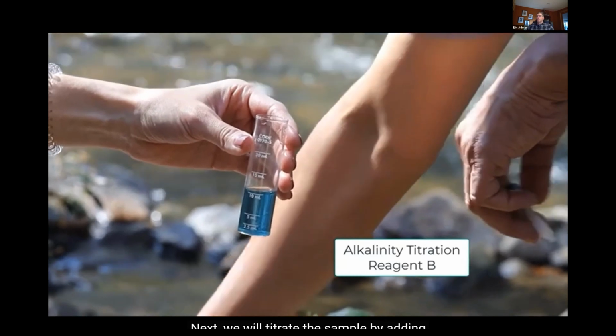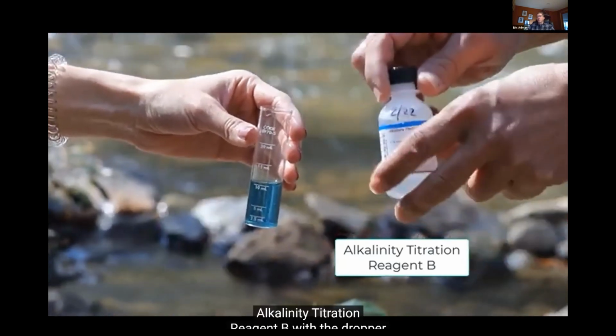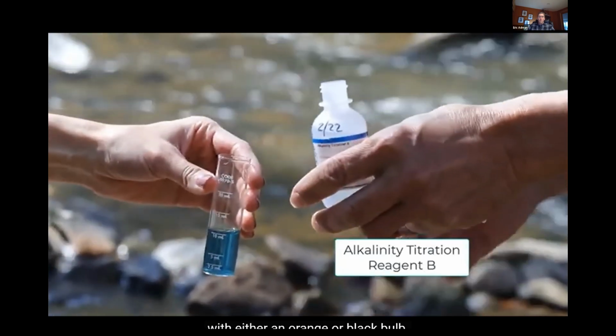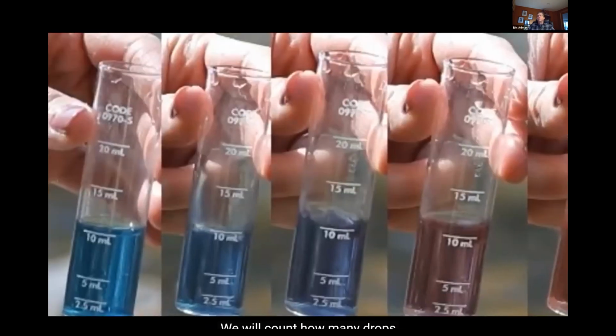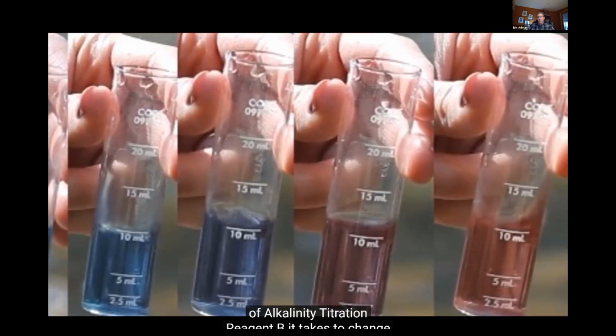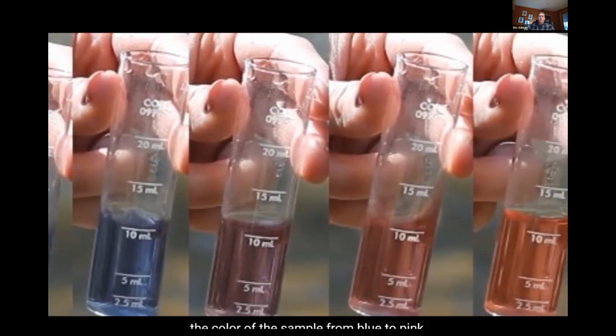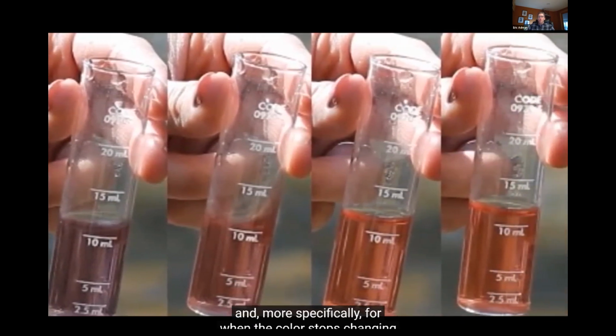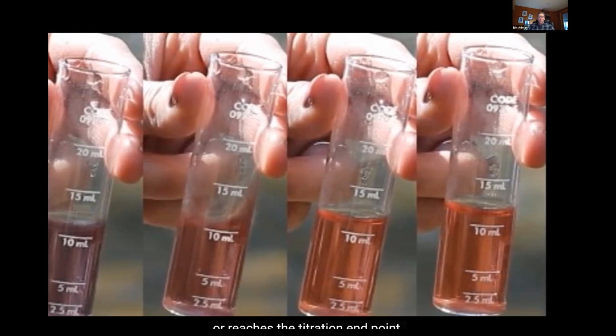Next, we will titrate the sample by adding alkalinity titration reagent B with the dropper with either an orange or black bulb. We will count how many drops of alkalinity titration reagent B it takes to change the color of the sample from blue to pink, and more specifically, for when the color stops changing or reaches the titration endpoint.